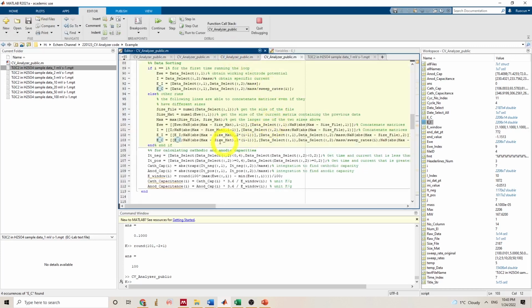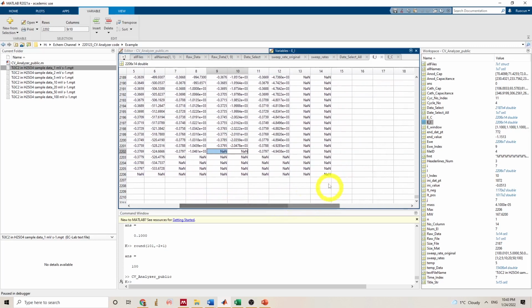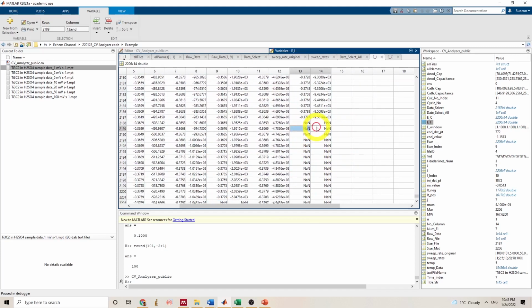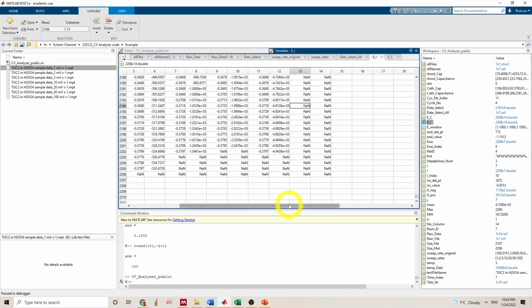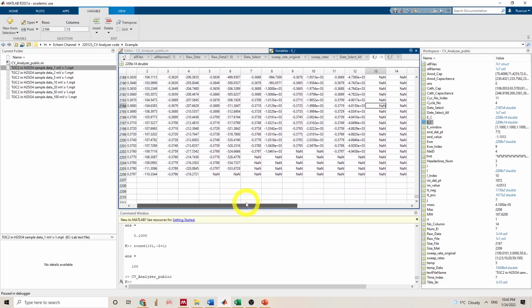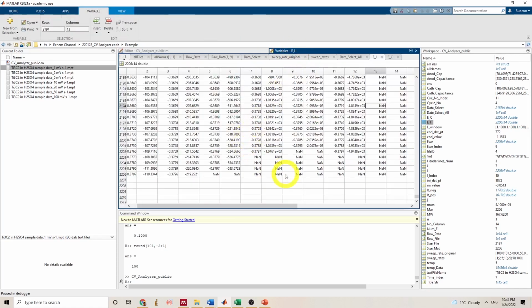The very complicated function we wrote here basically fills in a not-a-number value wherever the columns didn't have enough rows of data. For example, especially for columns 13 and 14, it filled up many of these NaN rows, so that these columns can be put together, and when we export them, this data will not be plotted in plotting software like Origin.